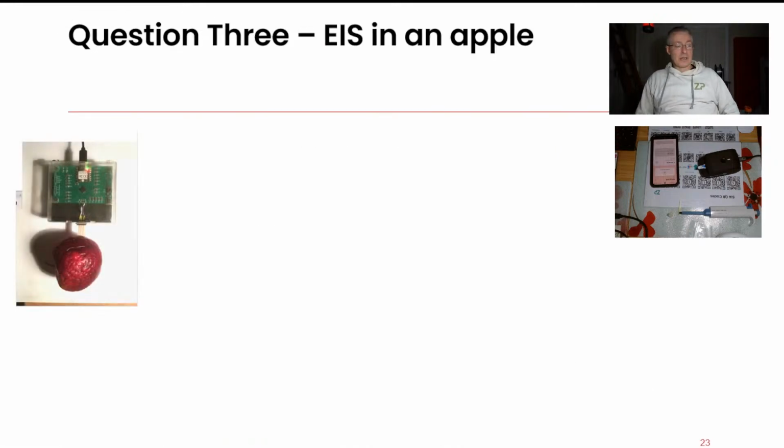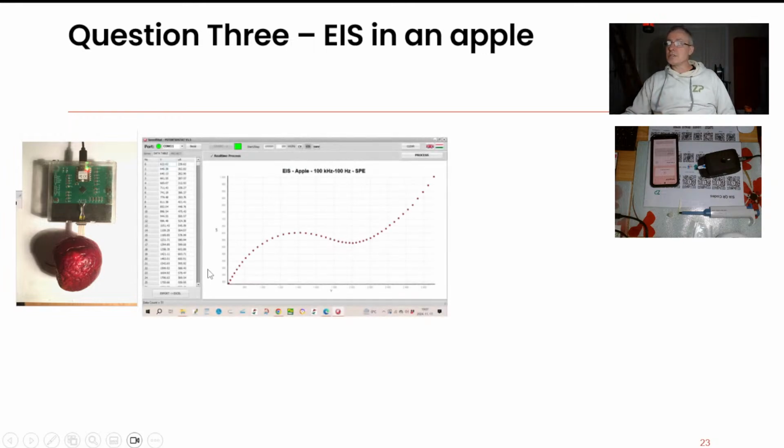Just a bit of fun this one is. So I quite like this because I get a nice email now and then from some guys in Hungary, and they basically develop their own electronics, and at ZP we develop our own electronics as well. They're in an academic setting, but they're nice people, and they asked me to comment because somebody had sent them this data, and actually they had quite a nice Nyquist plot, which was sort of showing that something was being oxidized, and then it had this kind of tail, which is probably an approximate.